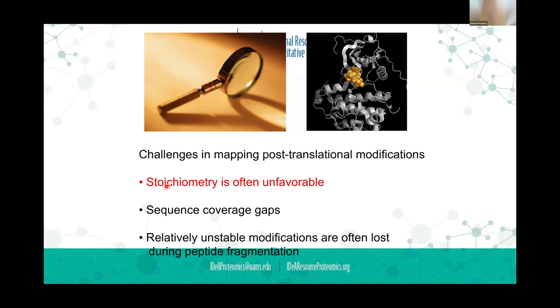Even if you take a serum sample and you don't deplete the abundant proteins and you digest it, you're not going to get 100% sequence coverage of albumin, the most abundant protein in the blood. You're just not going to do it because there are going to be regions that just don't produce good tryptic peptides. On average, in a proteomic experiment, you may see 30 to 40% average sequence coverage of proteins.